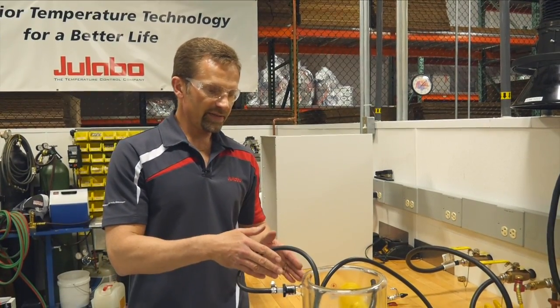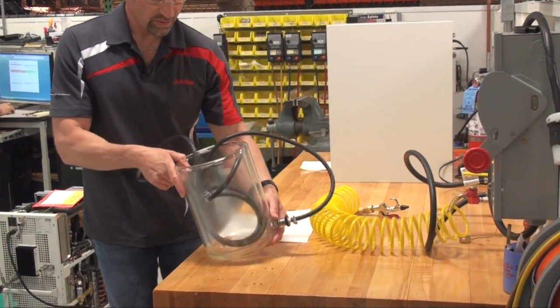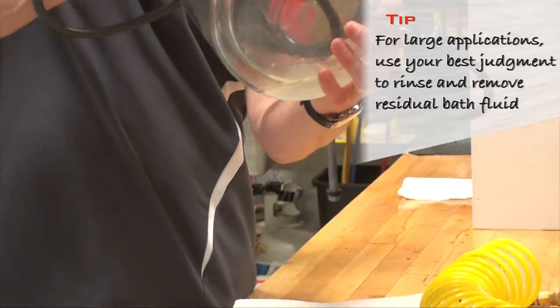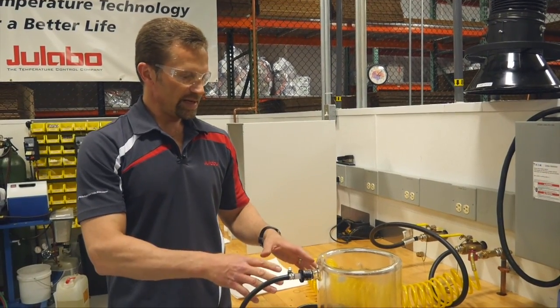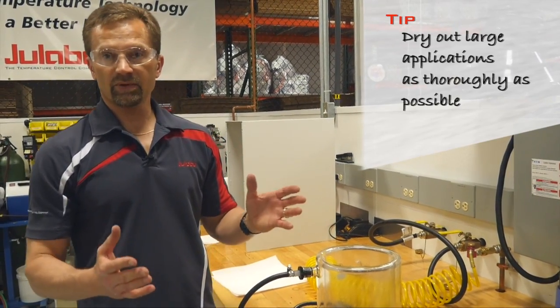In this case we added some ethanol into the jacket of this beaker and we are just going to rinse it around. We rinsed the tubing and the jacket and now we're going to dry it out as best as possible with some compressed air.